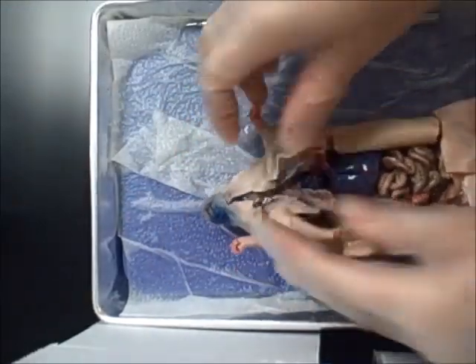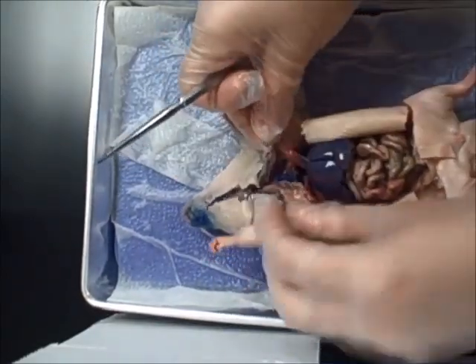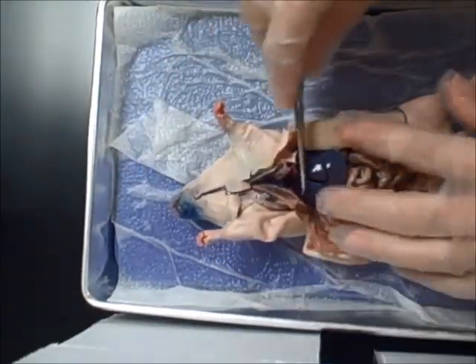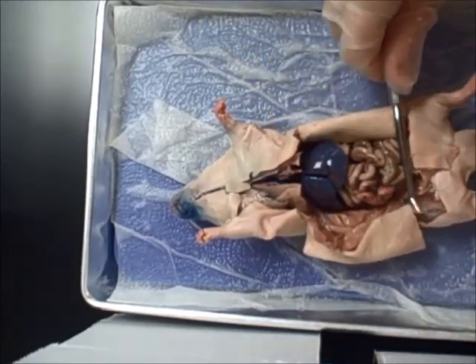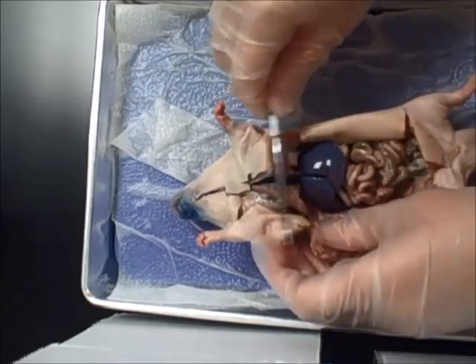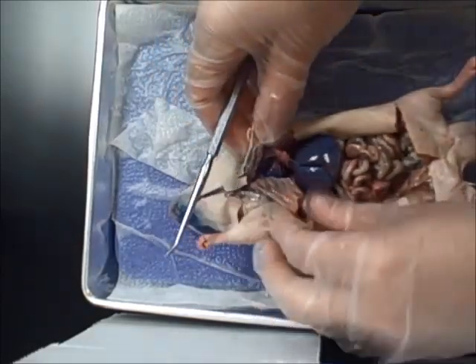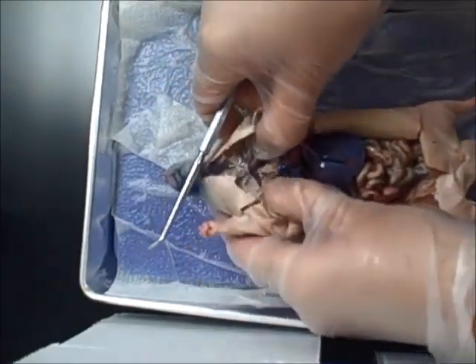All right, right here in the middle of the rat, we have the muscle that's the diaphragm. Diaphragm is this thin sheet of muscle that separates the abdominal cavity, everything toward the tail end, so posterior, and then everything anterior of the diaphragm is the thoracic cavity.